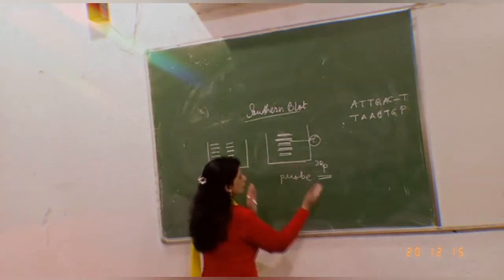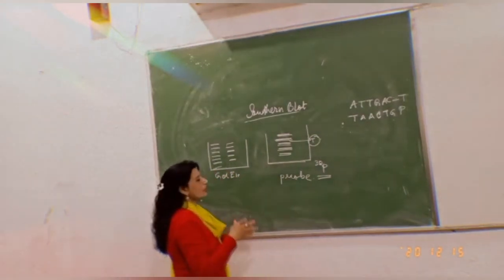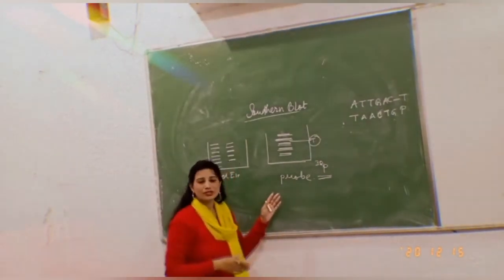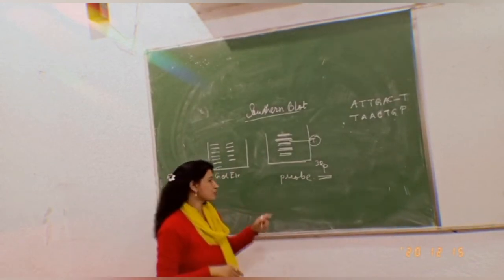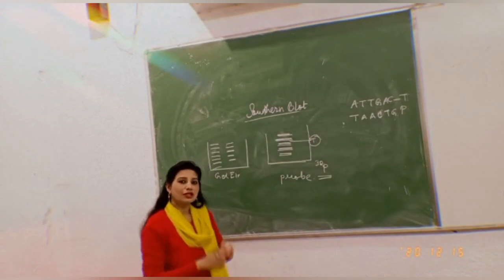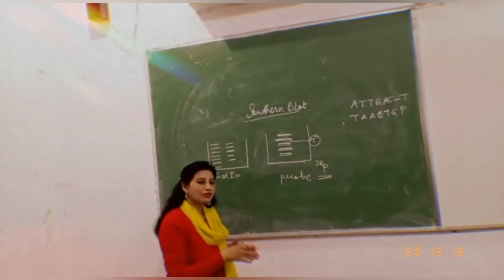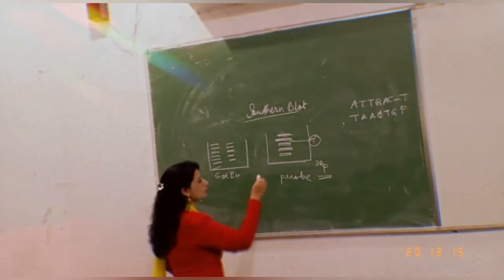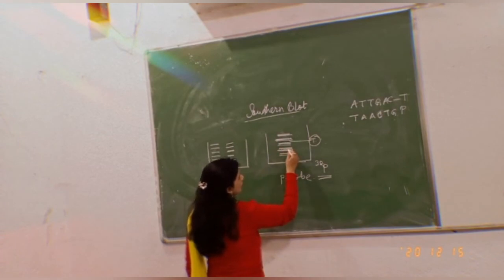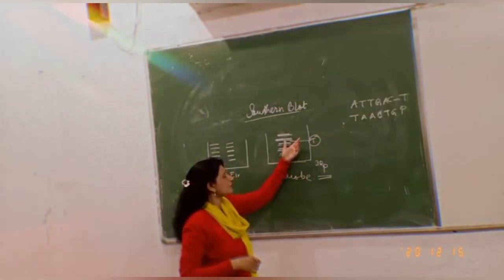So here, after the whole process, what I have done is I have used my nucleic acid hybridization, that is, the hybridization method. Probing time I will be using it. First it was denatured, then again the single strands were joining the probe. The probe had joined. It will locate. The probe will locate that yes, this is my matching. Here as my target is this, the probe will be matching with this strand. So it will go ahead and make a particular double stranded helical structure there only.